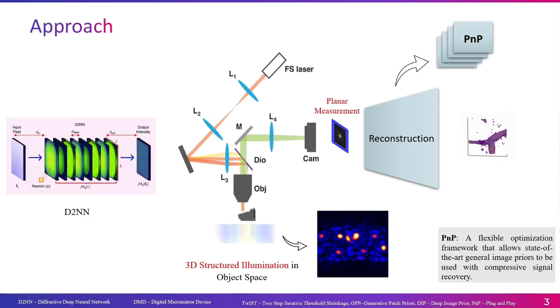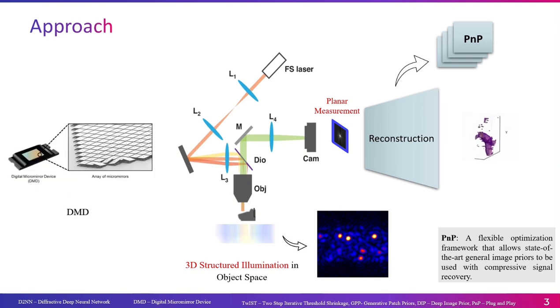Following this, we have the detector model designed with practical limitations. Finally, a reconstruction framework for leveraging the encoded information from planar measurements to reconstruct the 3D specimens.